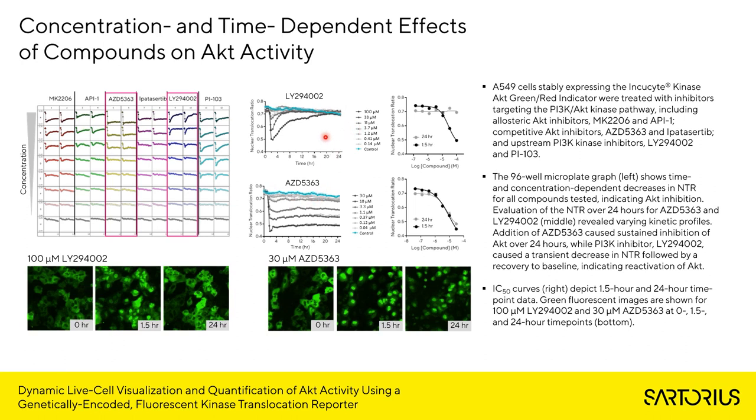LY294002 showed an initial decrease in that nuclear translocation ratio, indicating AKT inhibition, but we can see over time that returns to baseline, indicating a recovery from that inhibition, as opposed to AZD5363, which showed sustained inhibition of AKT over that 24-hour period of time. So this is how we can use the IncuCyte and live cell analysis to measure these responses of AKT inhibition over an extended period of time.